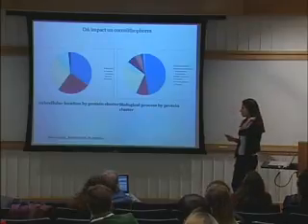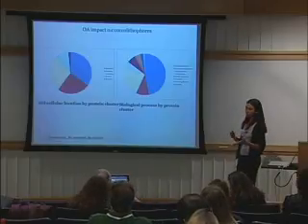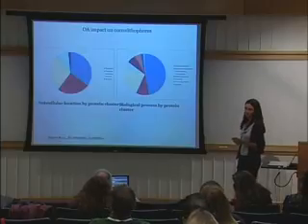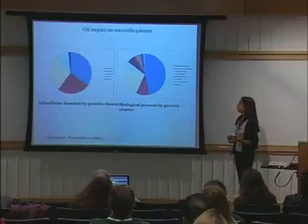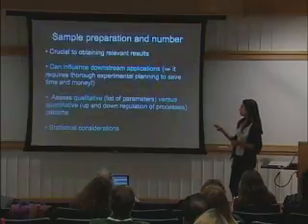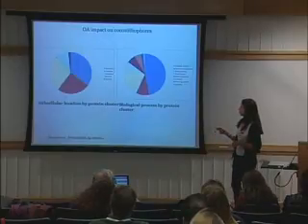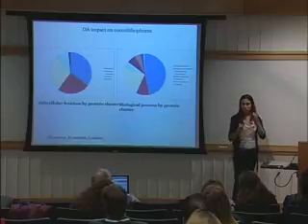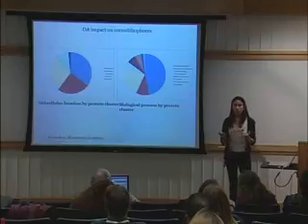And because you will get information about the subcellular location of the proteins that, let's say, are upregulated or downregulated, then you can look at biological processes and what is being upregulated or down. So here I have an example of membrane-associated proteins and nuclear proteins and so on. So this is for the static proteome paper that we did in exponentially growing conditions with modified F/2 medium.